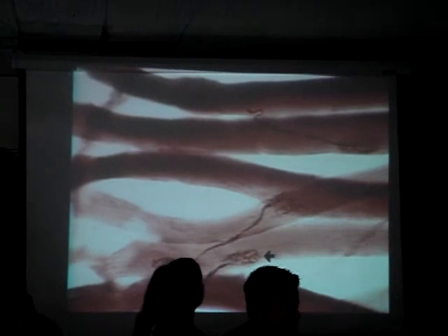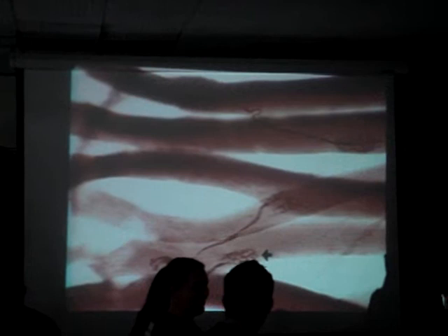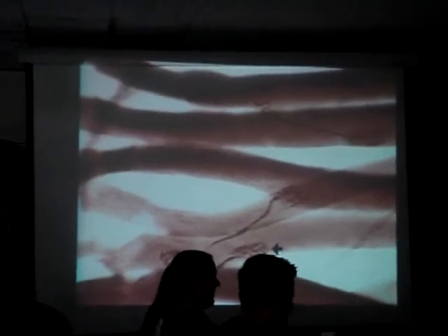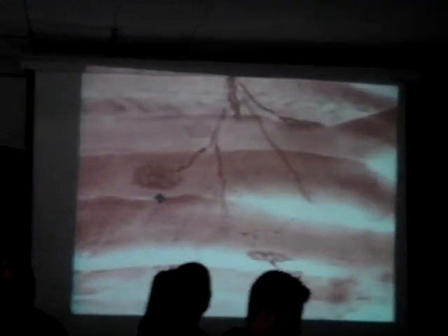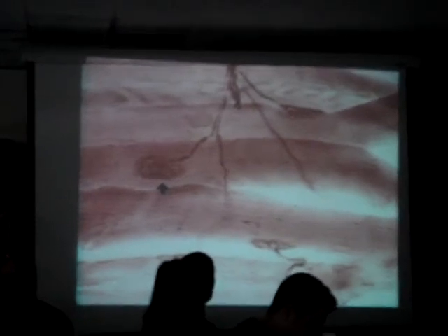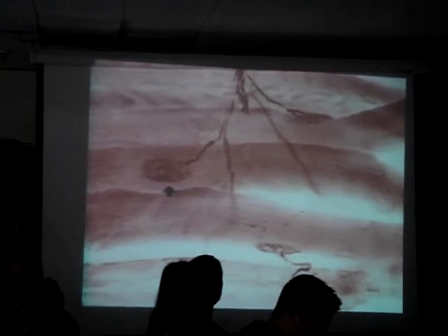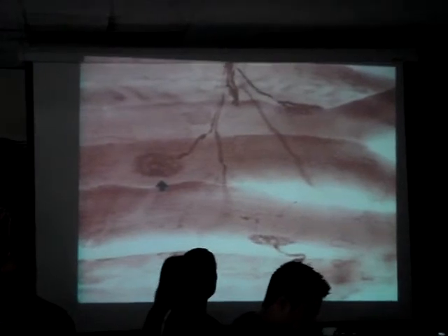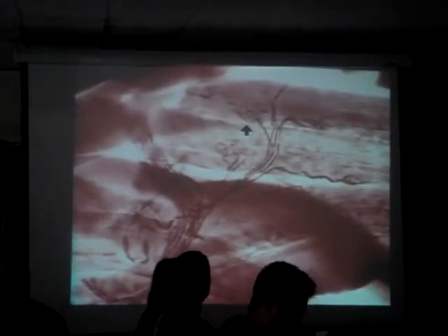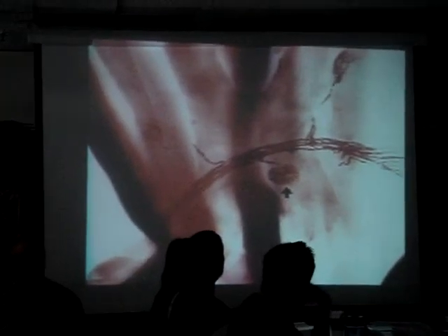And it looks just like the picture that's in the book. Oh, no, you did. Okay, this is kind of a nice picture because you can see many neuromuscular junctions on those different muscle fibers there. Notice the different branches of the axon leading to the different neuromuscular junctions. That one's not quite as clear as far as those actual junctions. Okay?